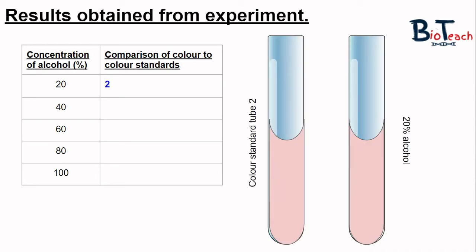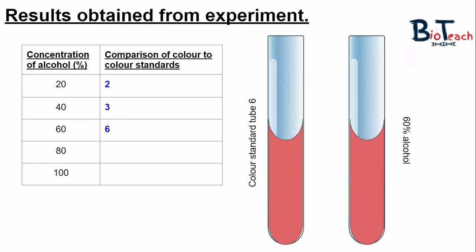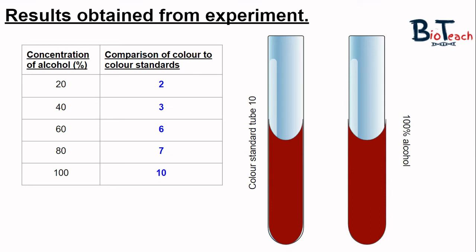When comparing, simply hold the boiling tubes side by side and visually compare. The colour standard tube 2 looks very similar to the 20% alcohol concentration, so record 2. For the 40% alcohol tube, it looks between standard tubes 2 and 4, with some dark and some lighter patches, so record the intermediate value of 3. The 60% alcohol tube looks very similar to standard tube 6, so record 6. The 80% tube looks between 6 and 8, so log that as 7. And the 100% alcohol looks the same as tube 10, so record 10.